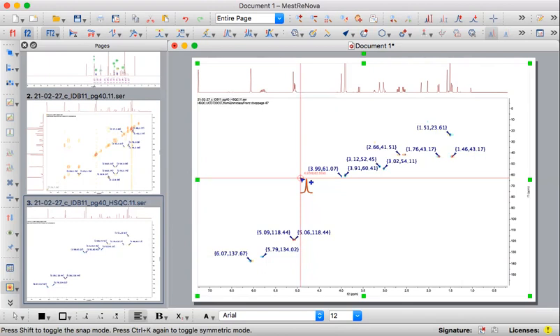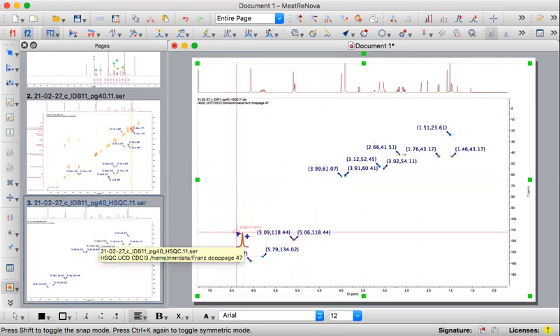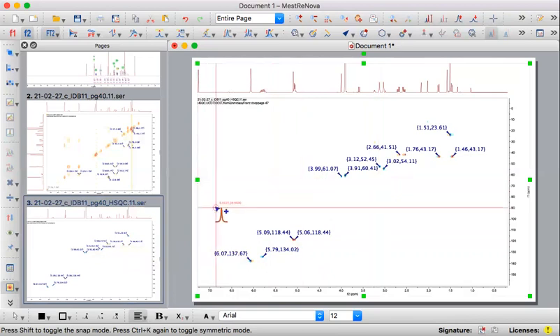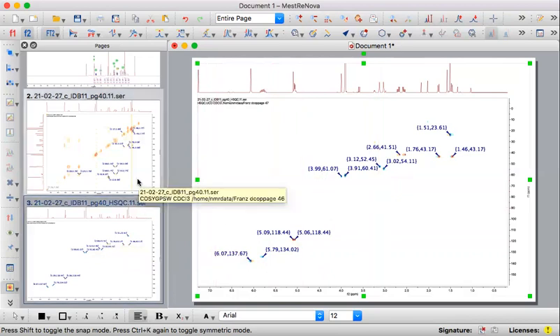of a paper. You don't need to print out the reporting of the 2D data. There are some times where you have to do that for ACS publications, but those are special case scenarios. That's not very often, so I'm not going to be going into that here. Pretty much all that you need to worry about for this is to reference it, baseline correct it, phase correct the HSQC, and then peak pick all of the appropriate signals. And that would be pretty much the end of the processing for this.